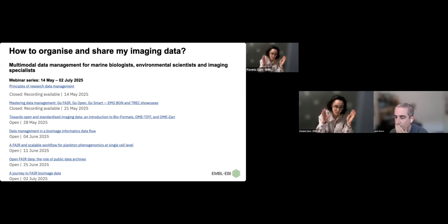We have quite a few interesting questions in the Q&A. So I see two questions that are kind of related to each other, so I will try just to rephrase it for the audience. Someone is asking, let's say I convert my raw imaging data, and then I do not want to keep the original version, the proprietary file. So I delete it, but at some point I need to switch back. So they want to know if and how they can do it. And another person is asking a related question: how can I be convinced that this is a safe practice, that I'm not losing any information from the initial image once I move it to the OME format?